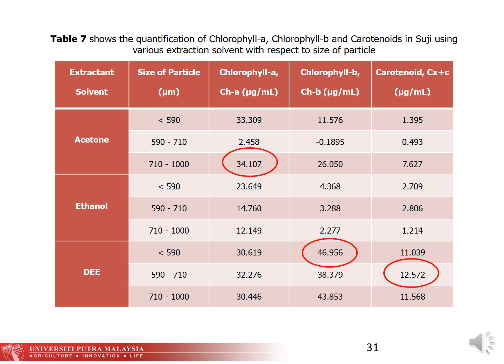This shows that the absorbance value is very small and might have occurred due to some errors such as incomplete extraction, the carotenoid and chlorophyll B disintegrated due to prolonged exposure to high temperature, and contamination of raw sample or in crude extract.